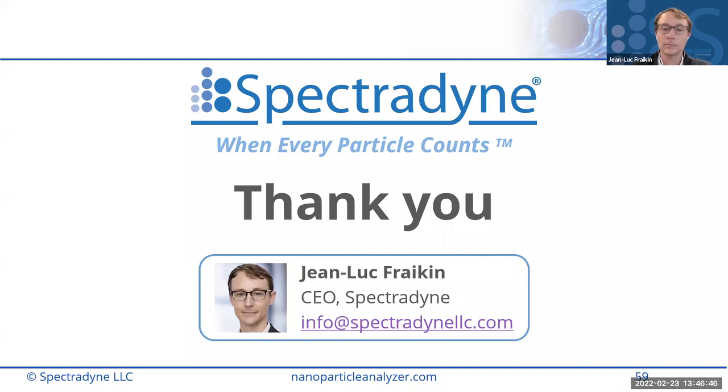Hello, everyone. Thank you, Jean-Luc, for your presentation. It's really helpful to have some summary of different available techniques. I have a few questions, but mostly it would be helpful, first of all, to clarify on the shown Spectradyne sample standards analysis. On some of them, there is a peak around 65 nanometers, where the graph starts. So what are they for the standards that are not 65, that peak is still there?